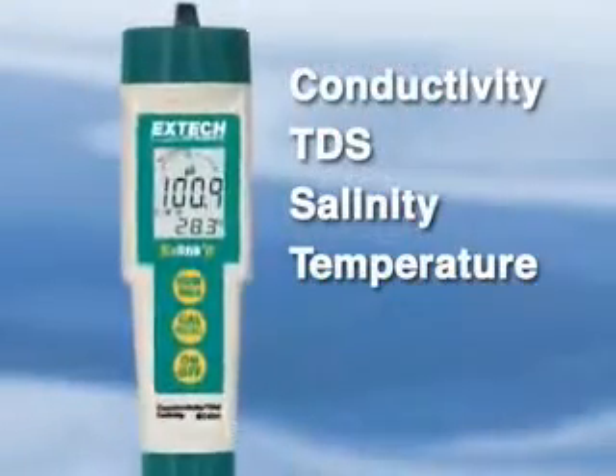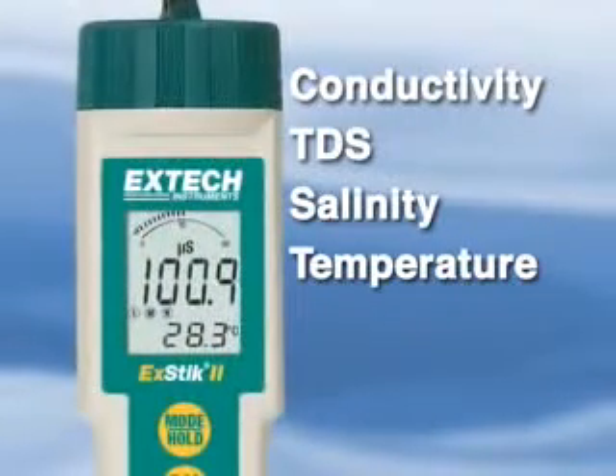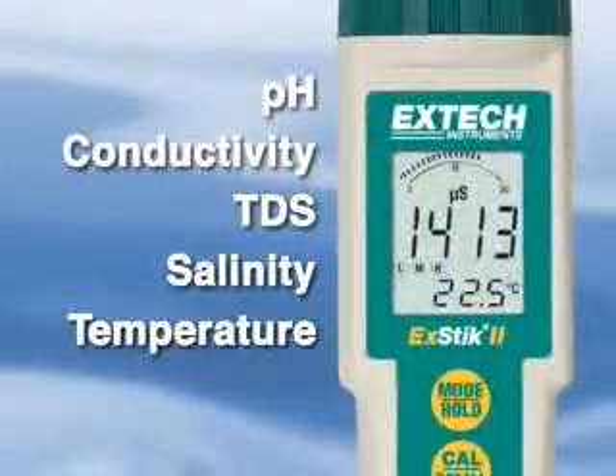The model EC400 is a four-in-one meter measuring conductivity, TDS, salinity, and temperature, while the model EC500 is capable of also measuring pH, making it a five-in-one meter.